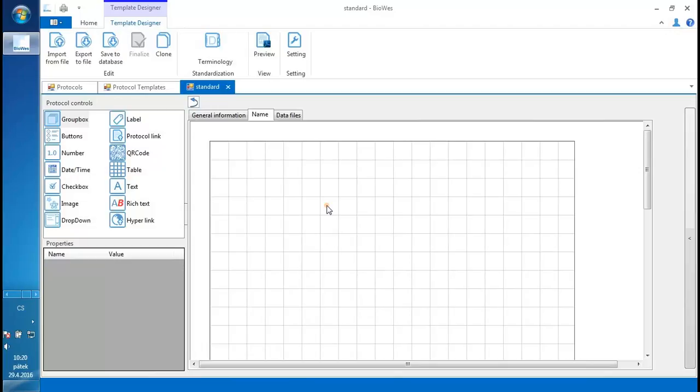So if we know the structure of the data that the microscope provides, it can be different, of course, for different measurement devices. So if you work, for example, with the mass spectrometry, then the devices usually provide a setting and so on and so on.